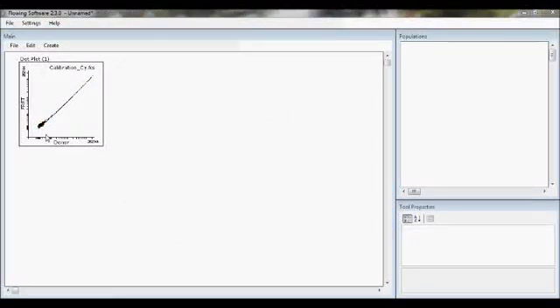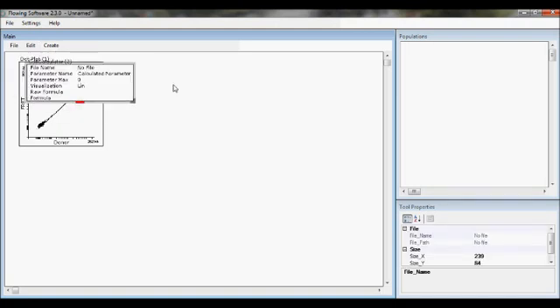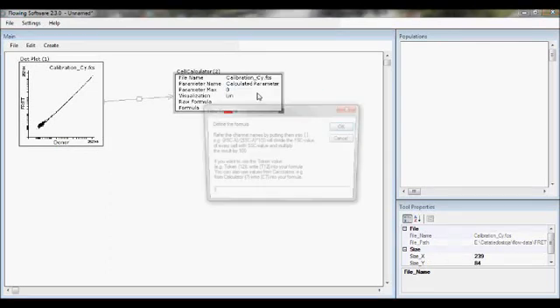Sometimes you might need to calculate something cell by cell. For example, in this case, in this sample, FL divided by donor, cell by cell, so you must know the new value for every cell. Create statistical tool, and cell calculator is the tool for that. Let's combine these and make the formula.